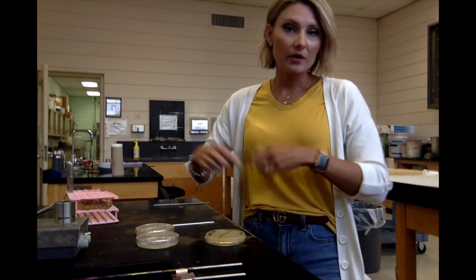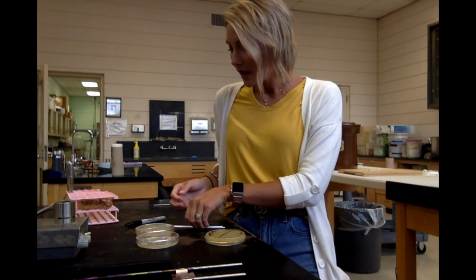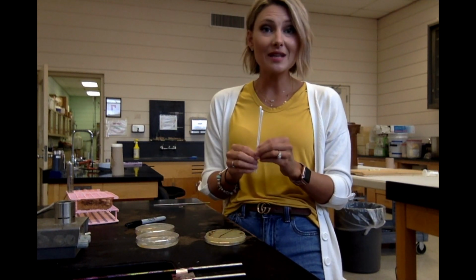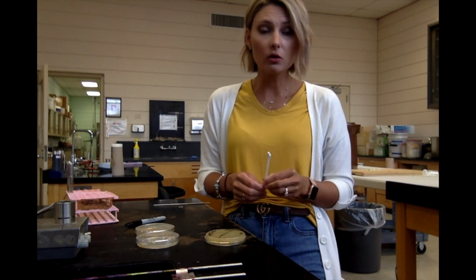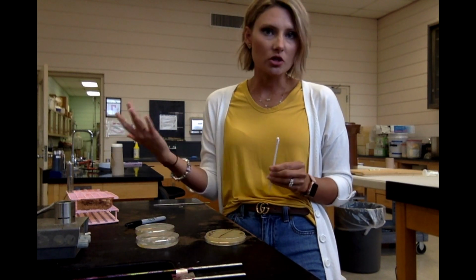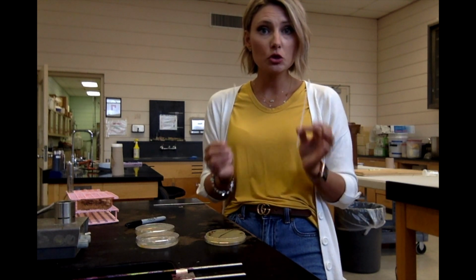Especially in here, when we have lots of people that are going to be using the same shelf to store their stuff. So I've got two sterile cotton swabs. Now, normally the way I have these laid on the table, you would not want to do that because you want to keep them sterile. But this is just a demonstration, so it doesn't really matter. So two cotton swabs because we're swabbing two different places.